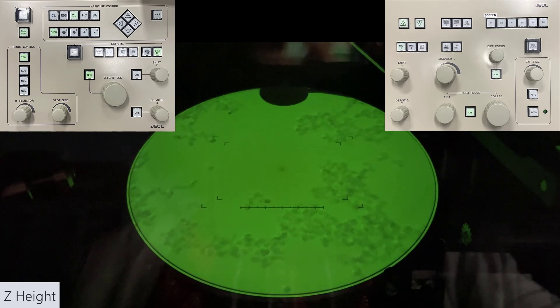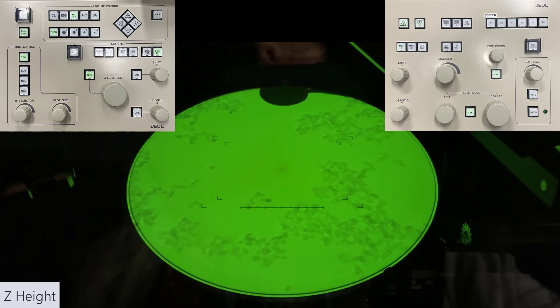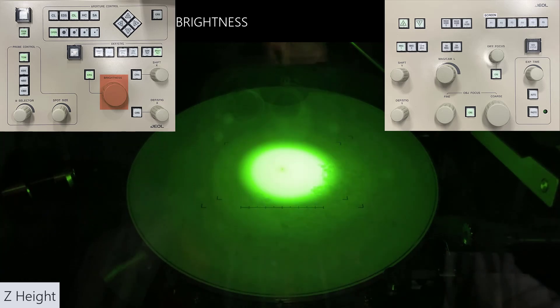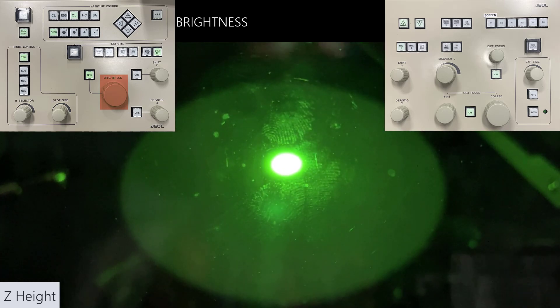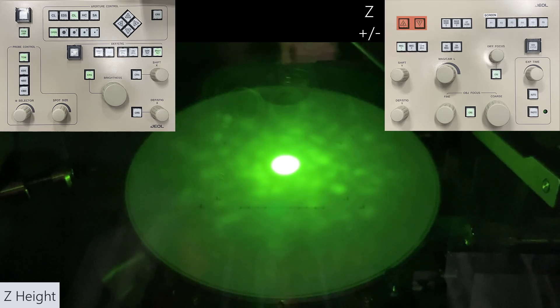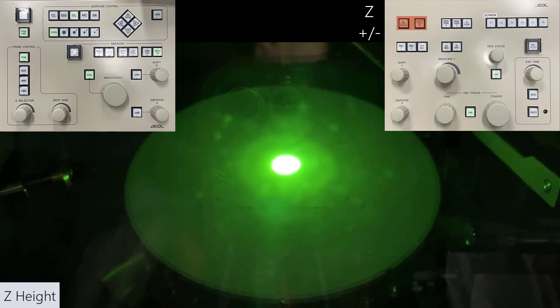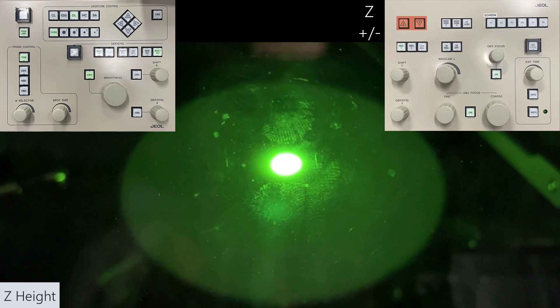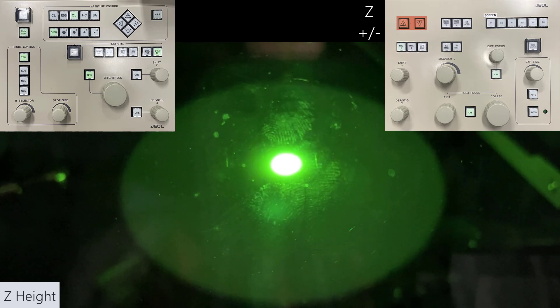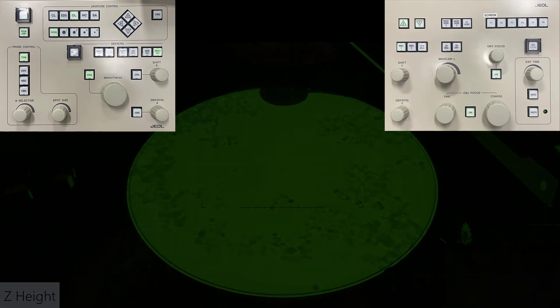There is another way to correct the Z height, and this is really good especially for materials that have low contrast. In this case, we converge our beam with the brightness knob to a point, and then we adjust our Z. You may have a diffraction pattern if you have crystalline material, or an amorphous disk like what we're seeing here. In either case, you just want to change the Z so that the material comes to that central spot.